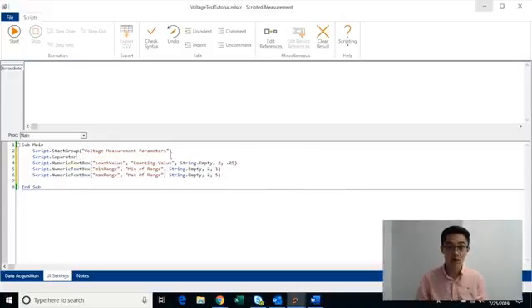Okay, so right now we're finished creating the UI. So in review, the UI settings script first calls start group, which creates the UI. It then calls separator, which creates a separator to format the UI. And then it creates 3 numeric text boxes in which a user can enter in parameters. Now we're going to switch over to the data acquisition script.